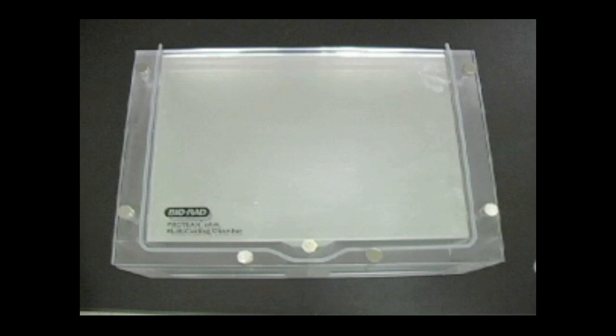Assemble the Protean Plus multicasting chamber with the desired amount of Protean Plus hinged spacer plates in the desired gel thickness and width.